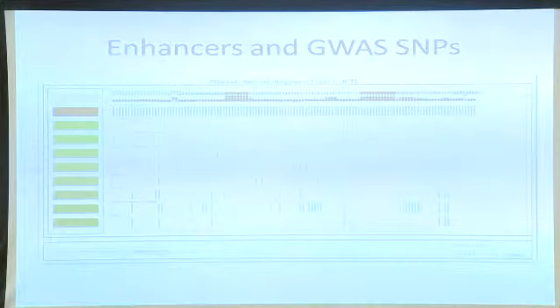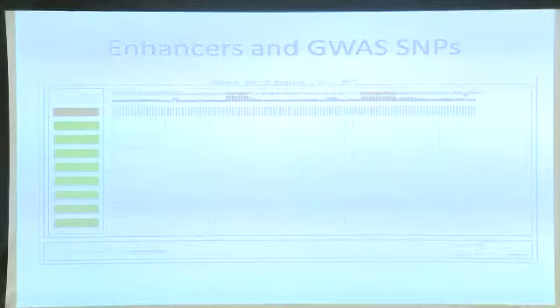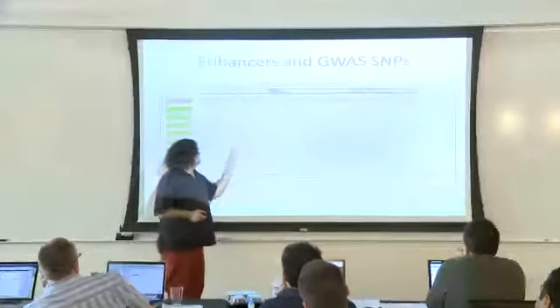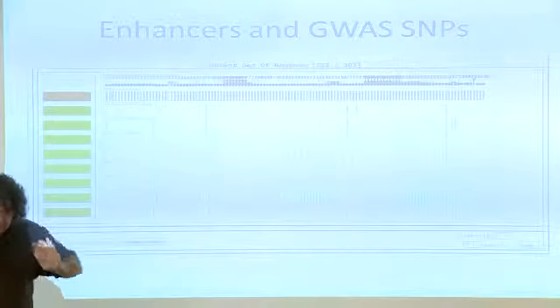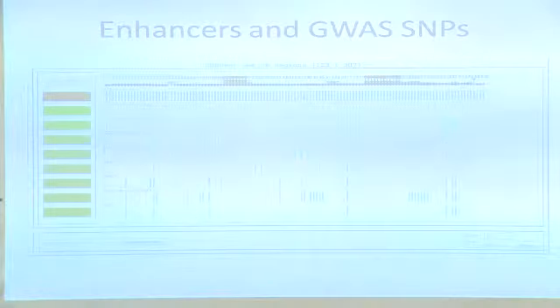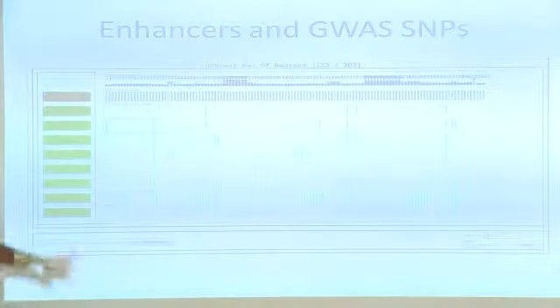People are still debating what's the best way to call this, and there are definitely things to consider, but this is a pretty good approximation. And then you combine them all into one single list of all the candidate enhancers. So that's what you're seeing here. This is not just running genomic coordinates. These are separate regions you see. So each column here is a single element. The fact that it's black here means it is a candidate enhancer, so it's an enhancer that was found to be active in some cell type. And below you can see which cell types it was found to be on. If you see something here that doesn't have any green under it, that's because the list that was used to produce that is 100 cell types long, and I'm only showing you here 5 or 6.